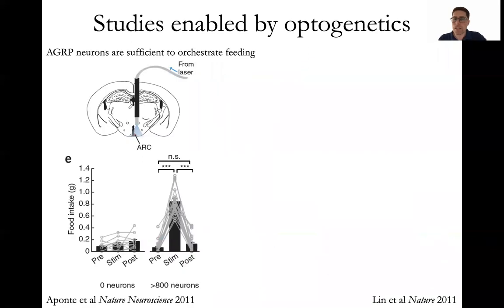Okay, so I haven't really mentioned yet the key part of optogenetics, of course, which is the genetics part: that we can target neurons for activation or inactivation using their genetic identity. So we can hit a particular part of the brain at a particular time, but also only influence certain neurons and not other neurons nearby. Again, getting at Francis Crick's so eloquently and concisely described dream of turning one set of neurons on or off while leaving the others nearby unaltered.